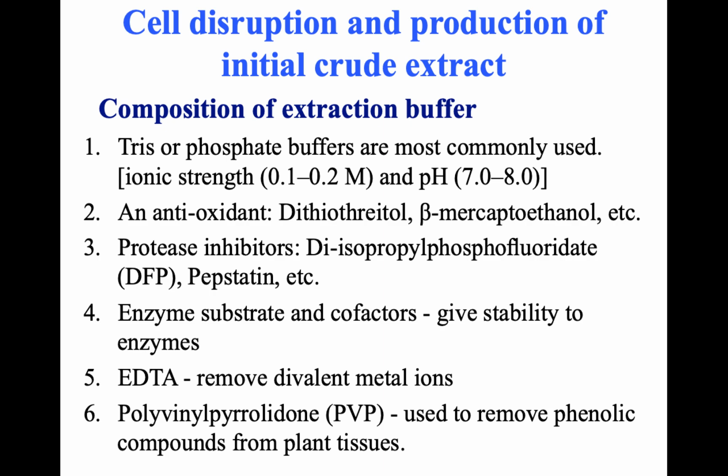In addition, we can also use protease inhibitors, because after the cell lysis, whatever proteolytic enzymes are there in the lysosomes will be released, and they will start degrading the proteins. To avoid this, protein purification is always done at 4 degrees Celsius.